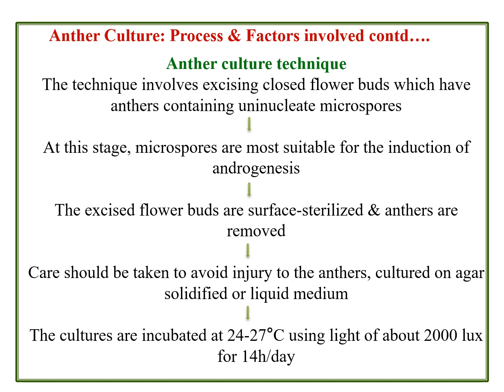The process and factors involved in the anther culture technique. The technique involves excising closed flower buds which have anthers containing uninucleate microspores. At this stage, microspores are most suitable for the induction of androgenesis. The excised flower buds are surface sterilized.